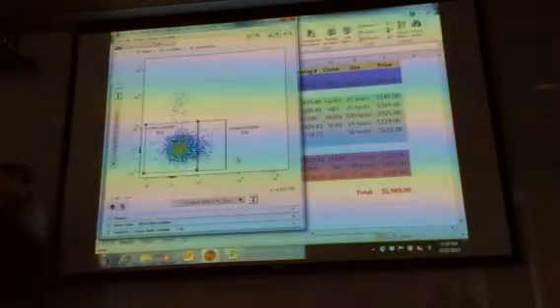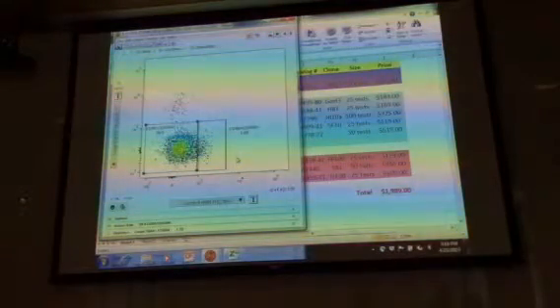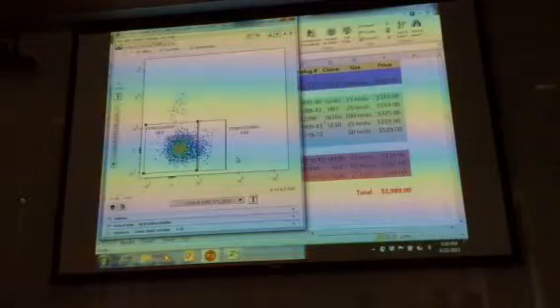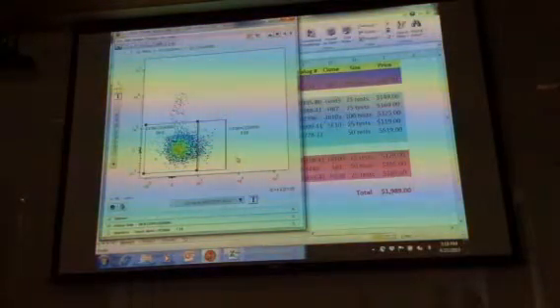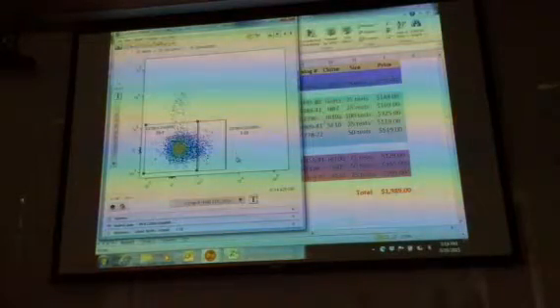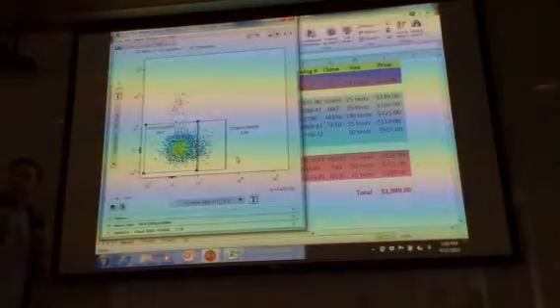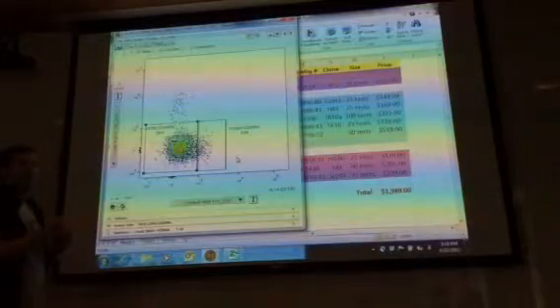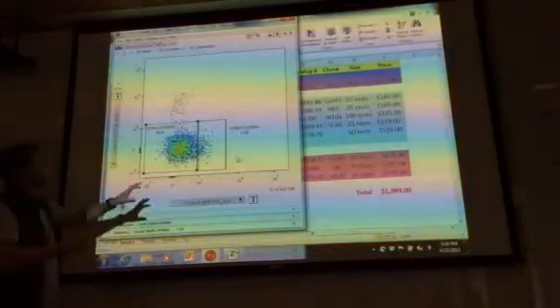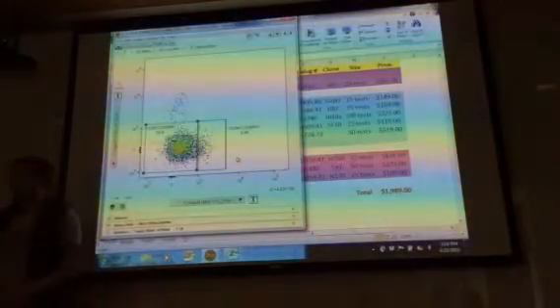Now, is that correct? Totally subjective. But what you should do is then go back to things like your unstained controls or your single stain controls. Go back and double check to see where you would put the cutoffs based upon all of your different controls. So you could go back and then you could reassign those gates.